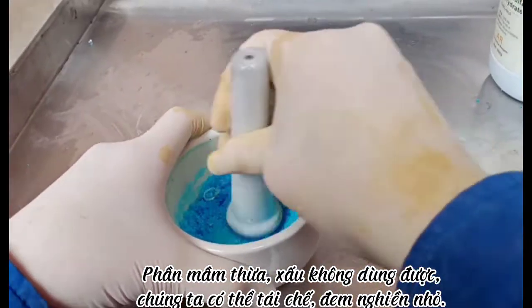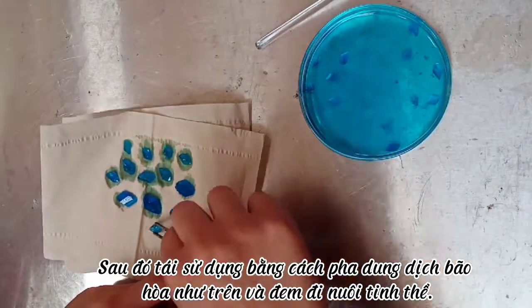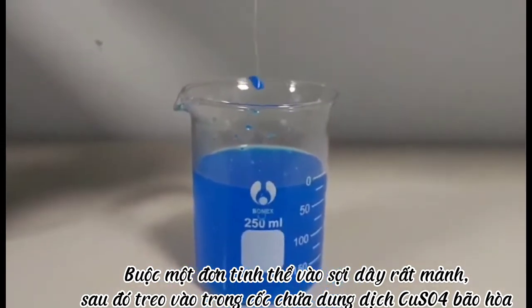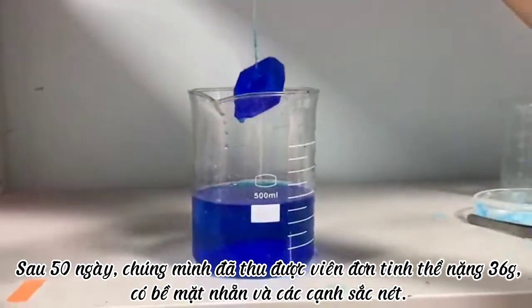If the sprouts are redundant or bad, we will grind them into small pieces, then reuse by making a saturated solution for crystal culture. Tie a single crystal to a thin string, then hang it in a beaker containing saturated copper-2 sulfate solution. After 50 days, we obtain a single crystal weighing 36 grams with smooth surface.